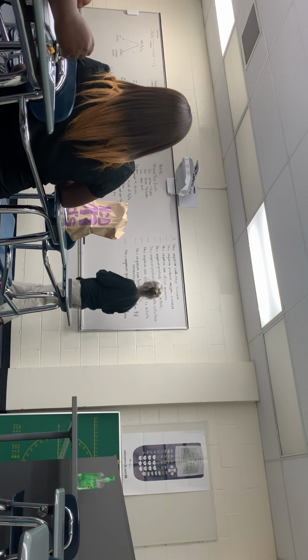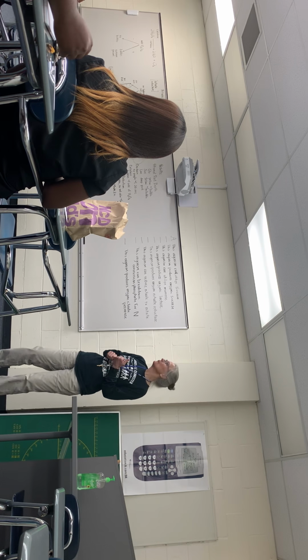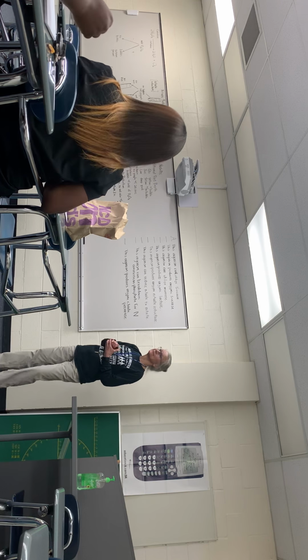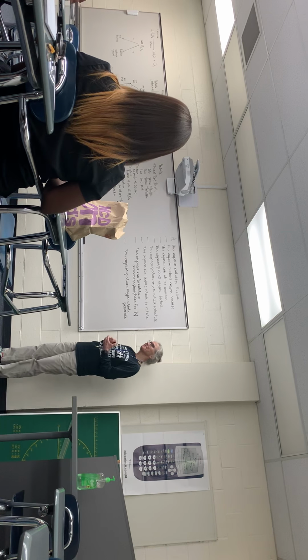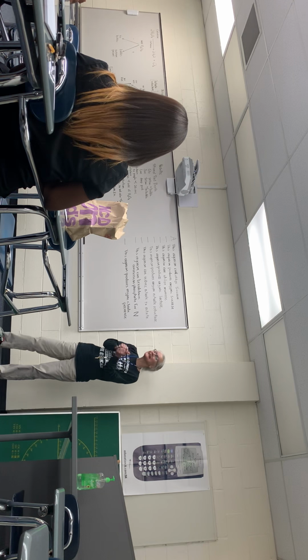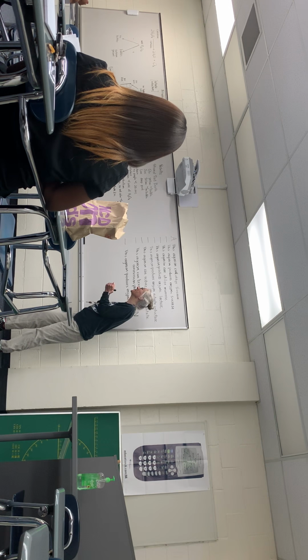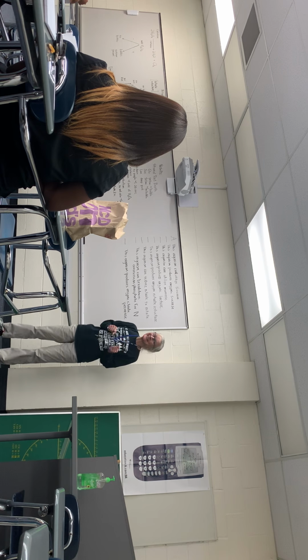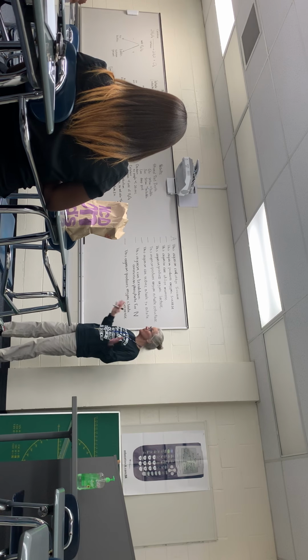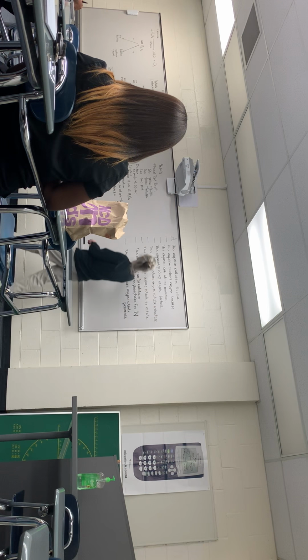This organism produces the enzyme sucrase. Is there anything that we could use to answer that question? Don't think so? Yeah. What does sucrase break down? Sucrose. Yeah. What color did our sucrose test tube turn? Yellow. So that means it's gotta be making sucrase, right? There's nothing else that breaks down sucrose except sucrase. So that would be acceptable.